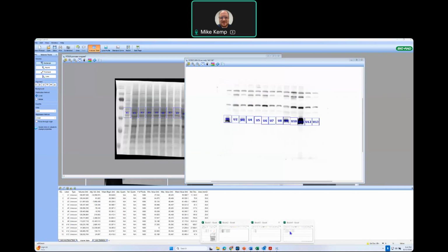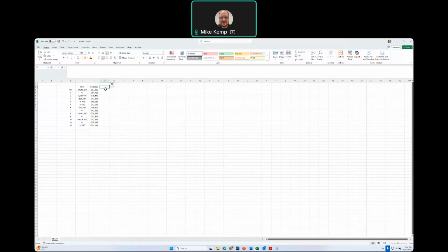So what we could do is just go back to that file and take the ratio. We're going to do formula equals that divided by, so E3 divided by F3. Copy it all the way down. Oops, I stretched it out wrong. And we'll get rid of all the extra digits here. And so again, this is sort of an arbitrary number.